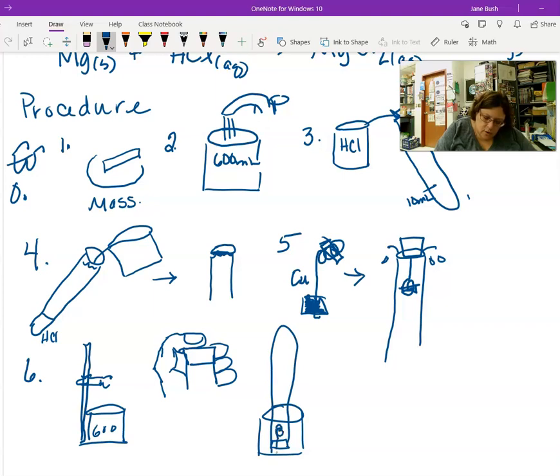So here's your wire, and what's going to happen, that heavy hydrochloric acid is going to slowly be able to come down and mix, and it's really cool to watch it. When you can see it, it's called Schlieren. Everybody say the word Schlieren. It's German, and you can see the mixing as the two densities mix. And as the hydrochloric acid makes its way down to the little copper wire with the magnesium, it will start to react, and you'll have bubbles coming up.